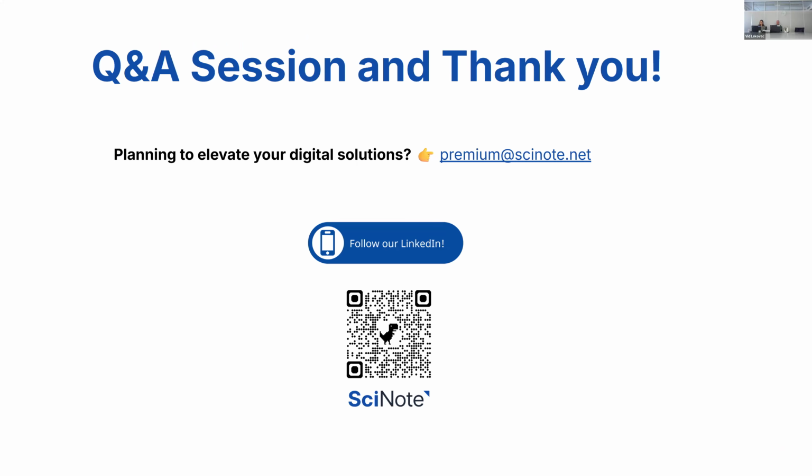So one came from Ayor. How to use the consumption option? The consumption option can be enabled, but it's only available in the second and third plan. The basic one doesn't have it. I'm not sure, Ayor, if you are an Essential user or a Professional one. What I suggest is reach out to us, reach out to your customer success manager, and we're going to make sure to check. Maybe you already have it and you don't use it, then it's going to be easy. If not, we can talk about what that means. We can also give you a trial. Of course, and you can check it out and see if it works for you. And then we can talk about that.